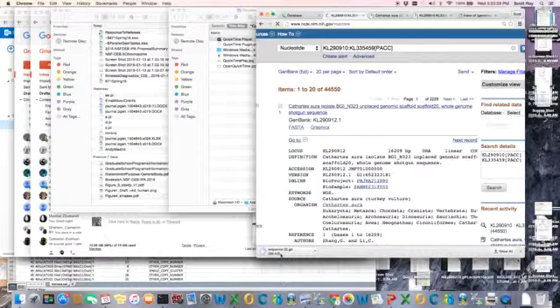Now it's downloading it to your local computer, which of course is a little bit of a pain in the butt. It means you're now going to have to SFTP it to Cinder, and I think you might have to SFTP it to Cinder and then SFTP it to Helix, which is silly, but for these genomes, that might be what we have to do. You can see I've got 2 copies of it downloading now, which is useless.